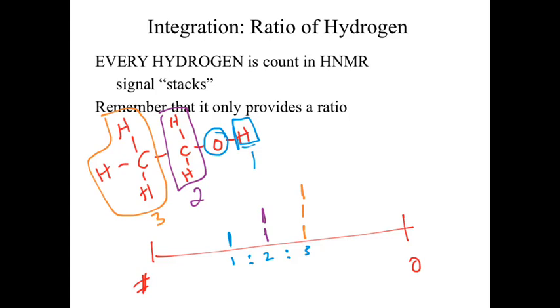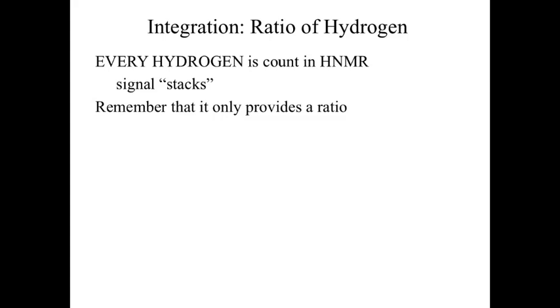If there was symmetry in the molecule, that means there's more hydrogens hidden somewhere that we didn't quite account for appropriately. And that's a little bit trickier to manipulate. I can't quite do it with this structure, but we will look at an example of that towards the end of this. So it only gives you the ratio. And ultimately, one conclusion is your peak height. So how can we see our integration? We're looking for peak height, which is an awful way to do it.